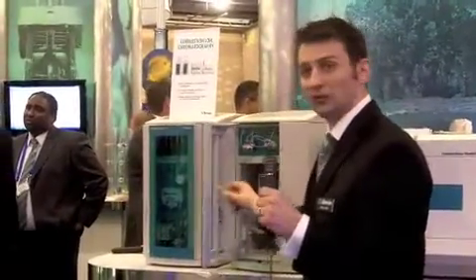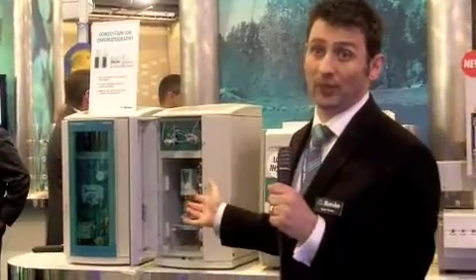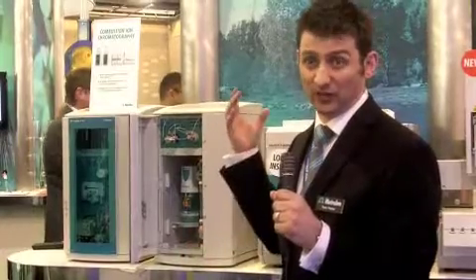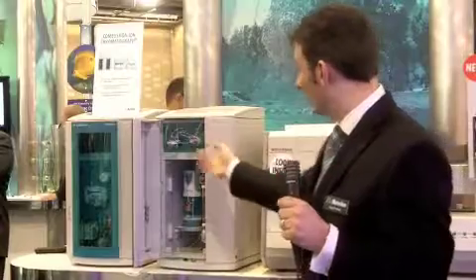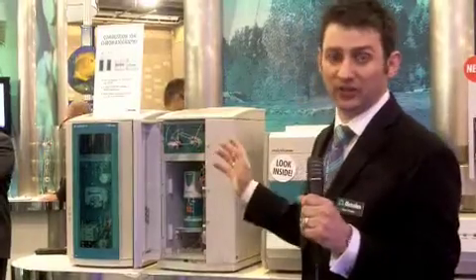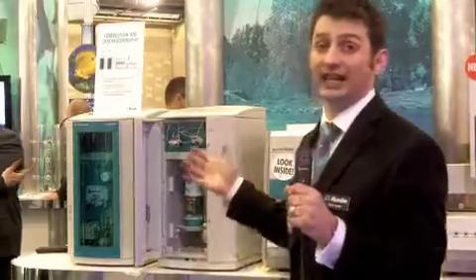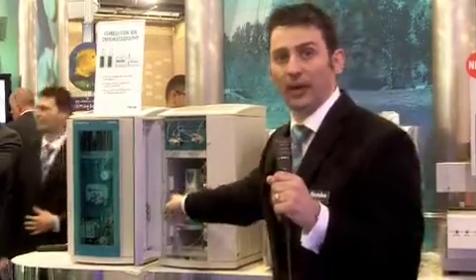On the liquid handling, we utilize the Decino technology. Anyone who knows anything about the METROM brand knows the Decino is a time-proven piece of equipment. It's a positive displacement pump — very accurate and very versatile. Using the liquid handling, we can do auto-calibrations from a single standard. We don't actually require any internal standard because all the flow and liquid dynamics are controlled by these pumps.